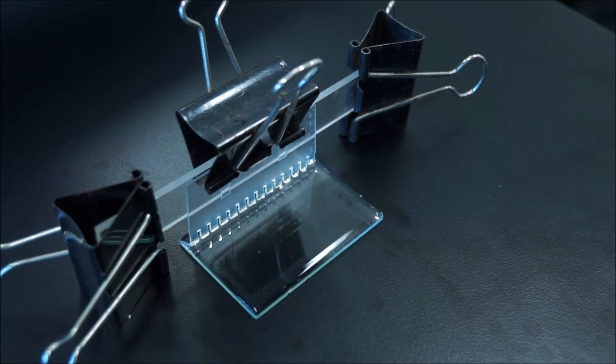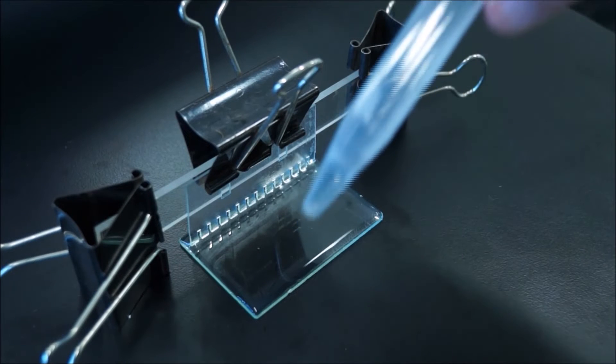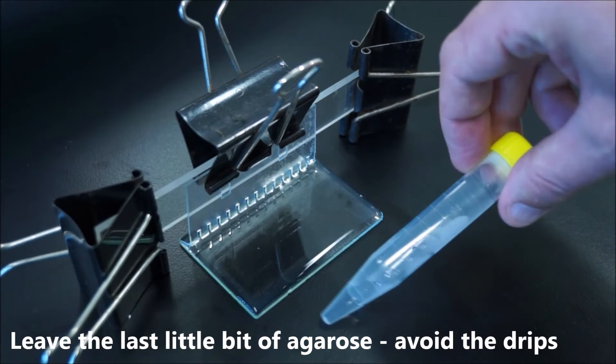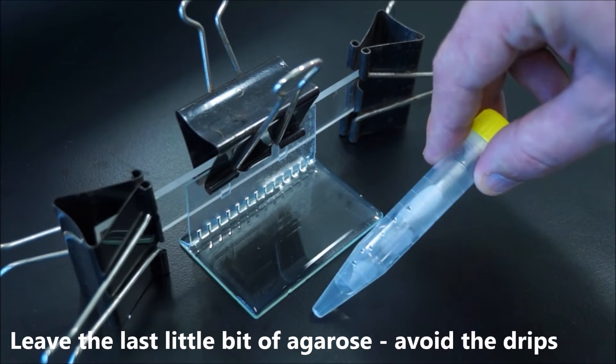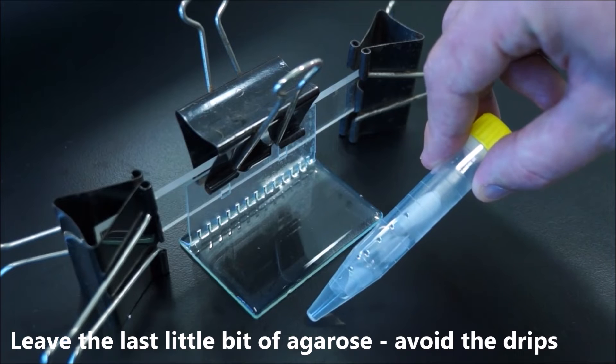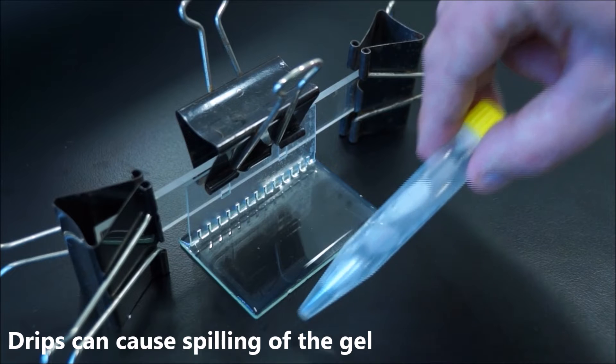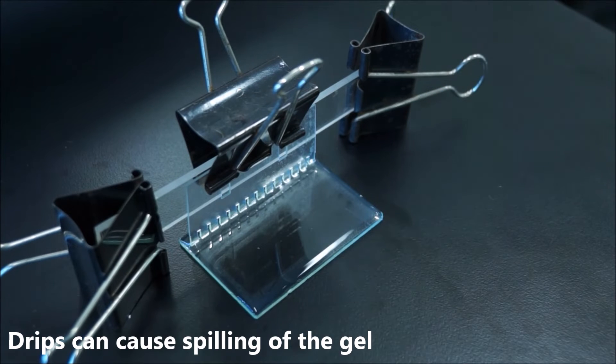If it pours off the edge, as sometimes it does, just let the gel solidify on the bench and we can clean it up once it's solid. You don't have to get every last drop out of the yellow capped tube. When it starts dripping, just take the yellow capped tube away. The drips might set up some waves and spill the agarose over.